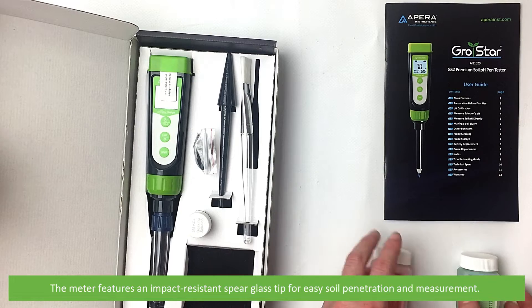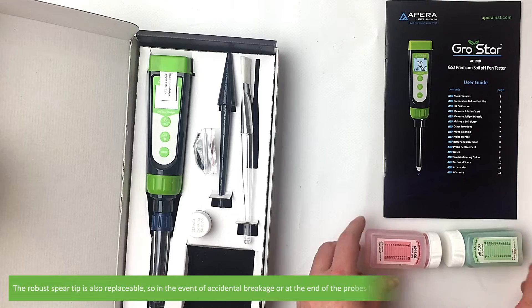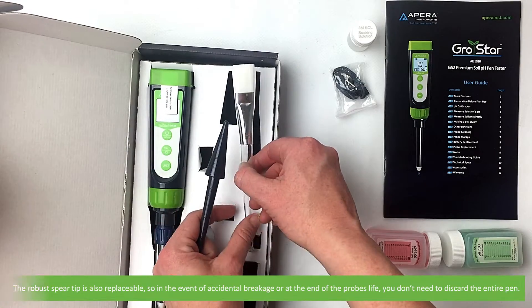The meter features an impact-resistant spear glass tip for easy soil penetration and measurement. The robust spear tip is also replaceable, so in the event of accidental breakage or at the end of the probe's life, you don't need to discard the entire pen.